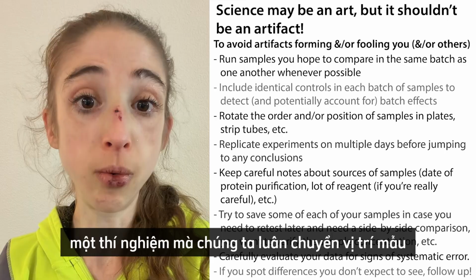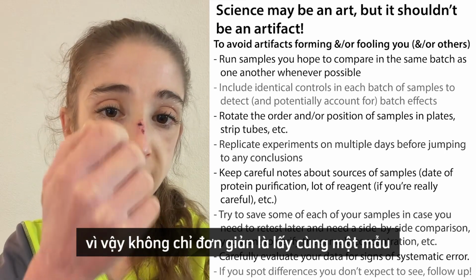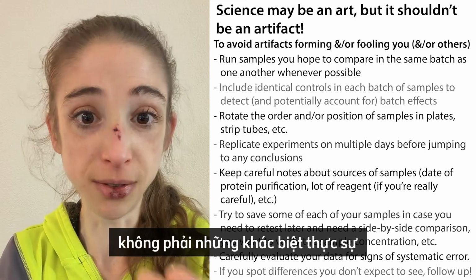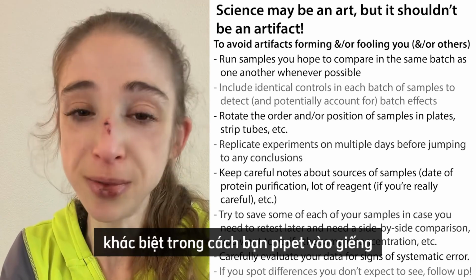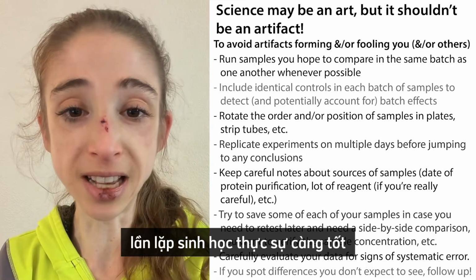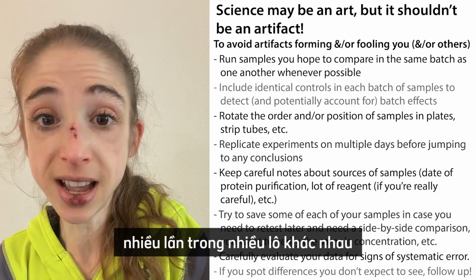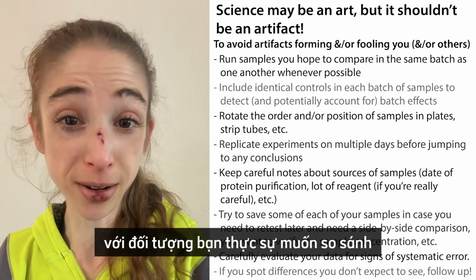An experiment where we are rotating our samples and have lots of replicates that aren't just technical replicates, so they're not just us taking the same sample and putting it into multiple wells. Those can only account for so much of the difference, not for the actual differences in how you prepared the samples, only the differences in how you pipette them into the well. You want to have as many real replicates as possible to account for differences in the sample. In most cases, the best thing you can do is test the sample multiple times in multiple batches, side by side with the thing that you actually want to compare them to.